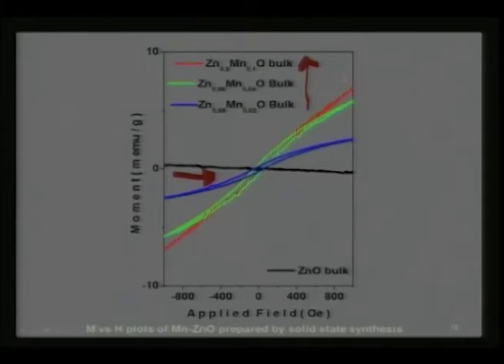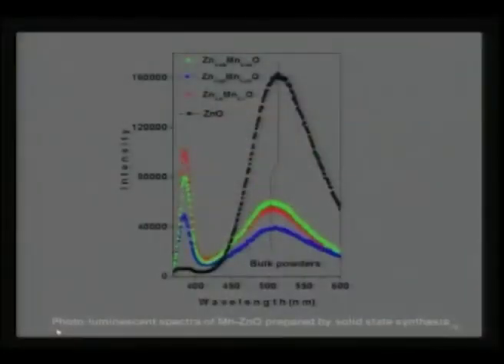So this magnetic property is actually coming from Mn interaction rather than coming from a pure doped situation. We will see other examples in the next few slides. In the same sample we can also get a clue whether manganese is really getting doped.